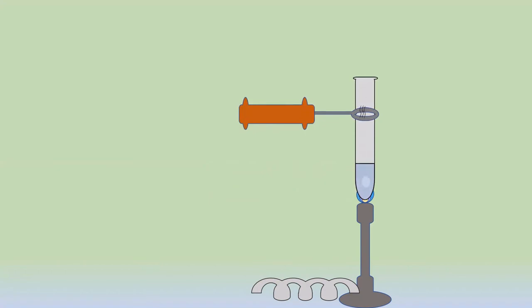Okay, now previously जो experiments हमने किए, उस experiments में क्या था, we have used ethanol as a solvent, right? 50% ethanol or 100% ethanol as a solvent for the recrystallization. Ethanol is a flammable liquid, so therefore it is expected we are not supposed to heat that test tube directly on the flame like this. Okay, what we have done, we have used the water bath. In water bath we have kept the test tube.